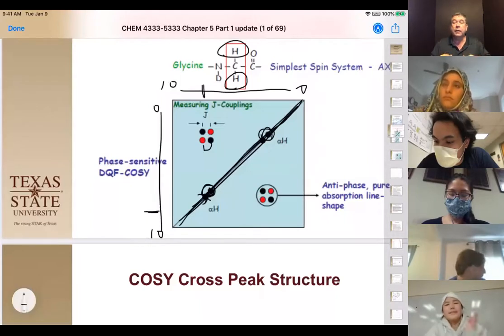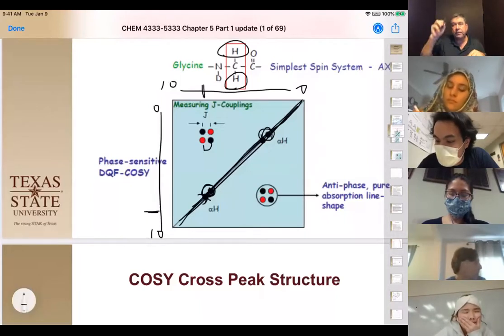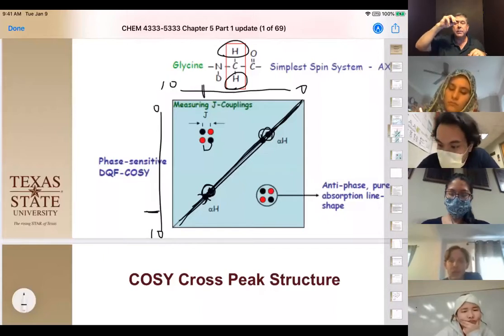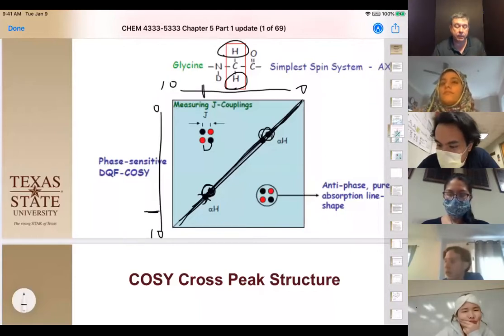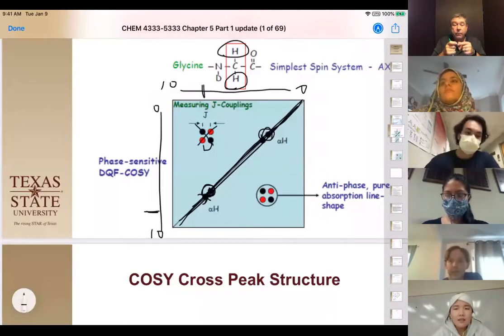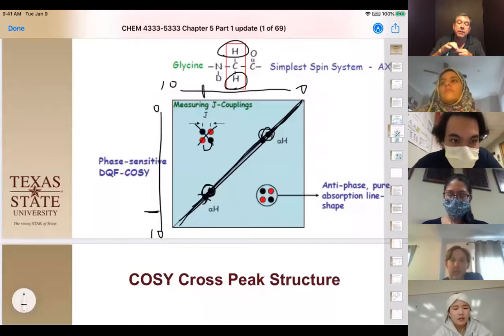We have these oscillating signals, and one of them is going to be the up phase and one the down phase. In most of these cases, we'll see up phase and down phase across from each other, but all 4 of those are combined to make the signal that we see.